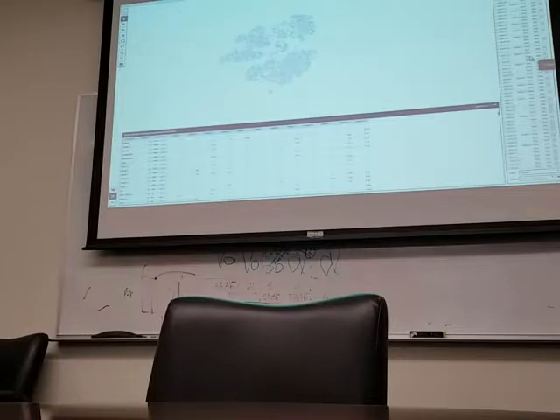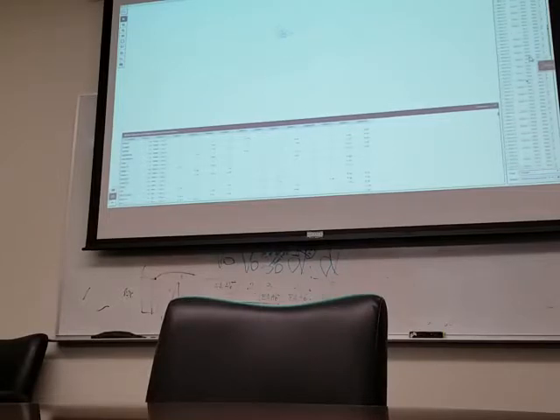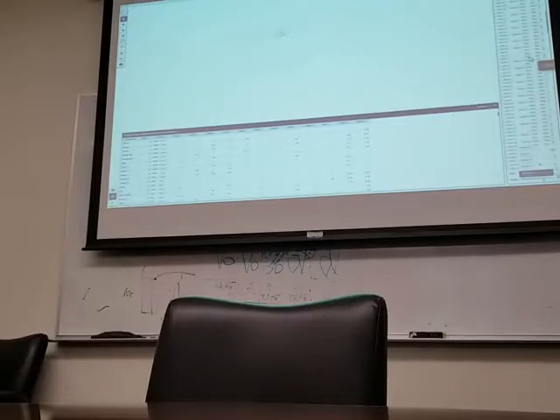And I think there was a cell ID in that, I don't recall. But once we have that data, we can see whether, so it tabulates them. There's a column that says frequency, and it goes from 1 to 6. But if we can combine rows to make a clonotype on a looser CDR3 similarity, then the frequency will go up, maybe even higher. Yeah, that's right. And then for clonotypes that have multiple cells, we can go back to the cell data, figure out which cells those came from, and overlay it on the transcription to see which clusters they show up in. Right, that's exactly it.